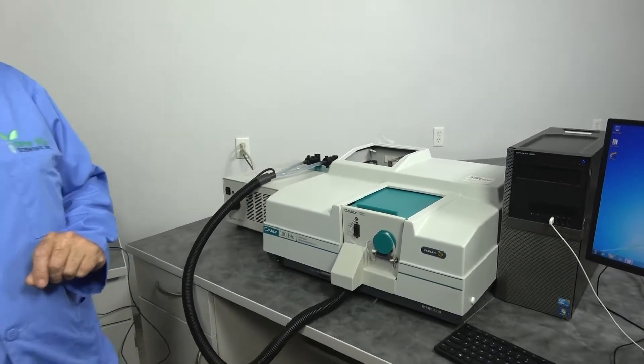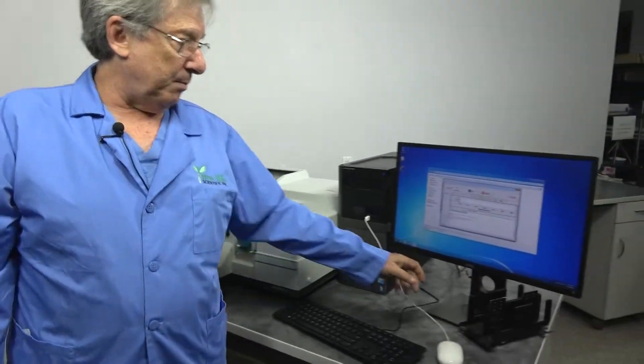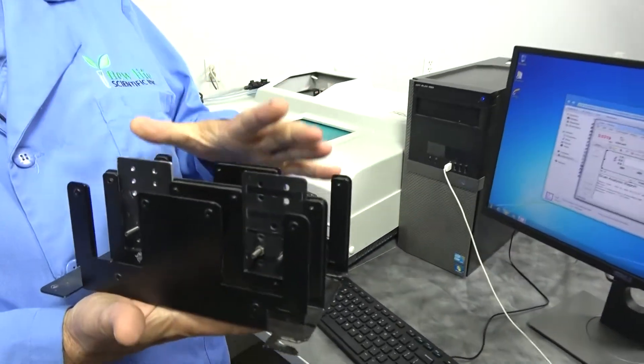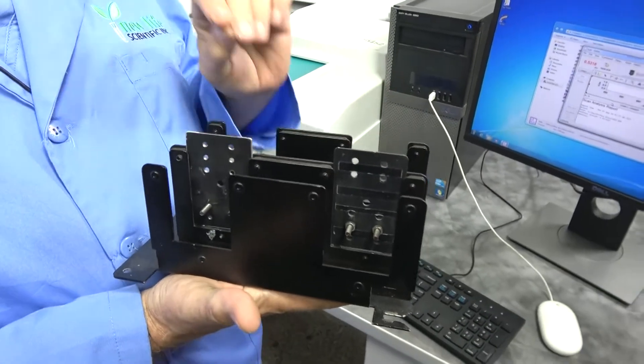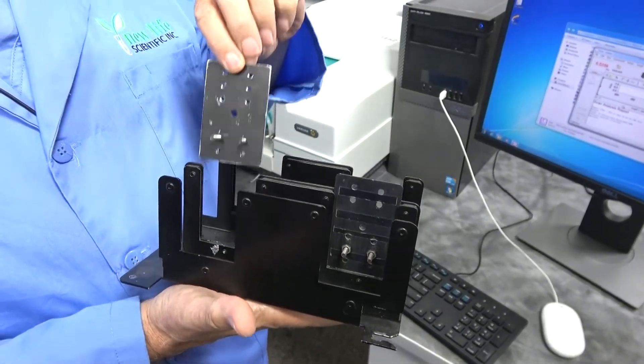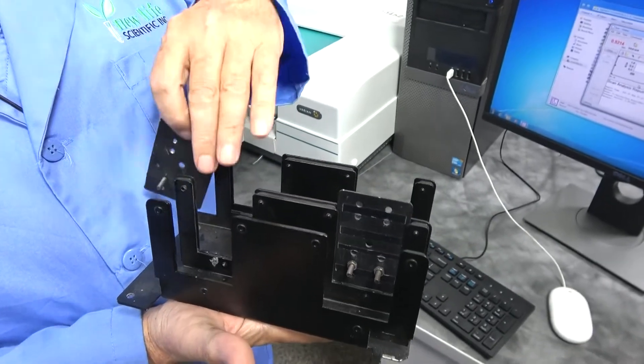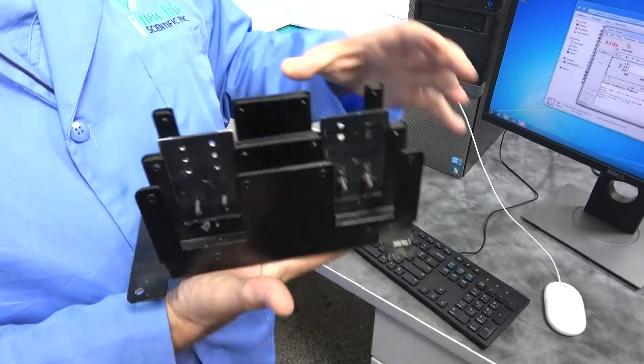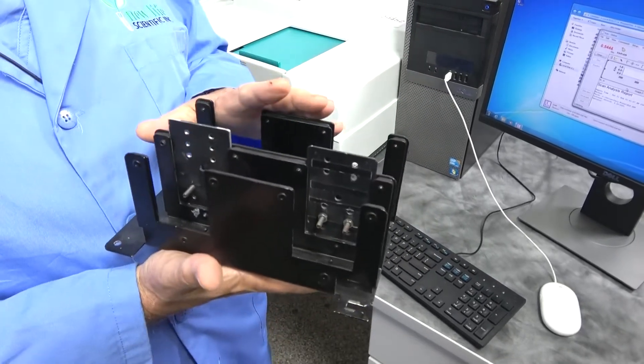The third option that we see is a sampler rack, but for solids. It could be used for determining color of glassware. It would be mounted in the units on similar panels. It could be used for cuvee. There's a number of different uses for this.